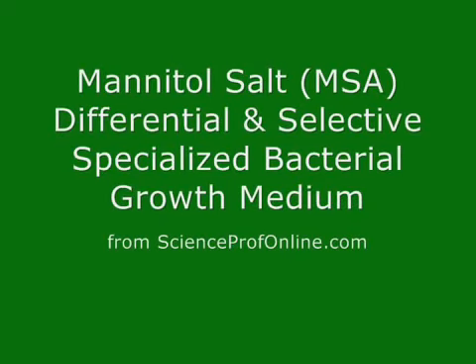In this video, I'll teach you the basics of mannitol salt specialized bacterial growth medium.